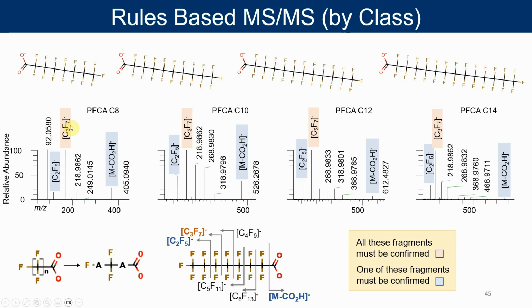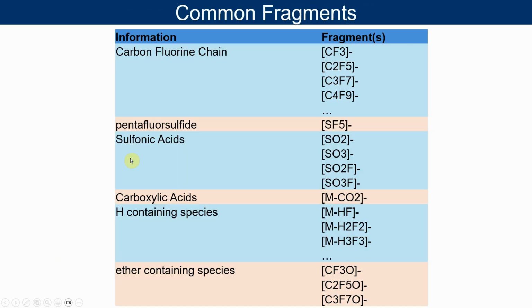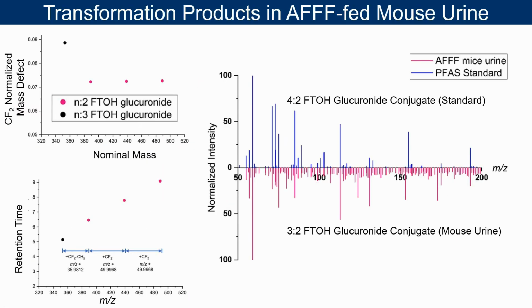That means that the computers themselves can name compounds if you know how those compounds will fragment. And so for fluoromatch particularly, that's what we call a score A, less than 5% false positive. And we have a database with tens of thousands of spectra or rules in this way where you can annotate compounds confidently.